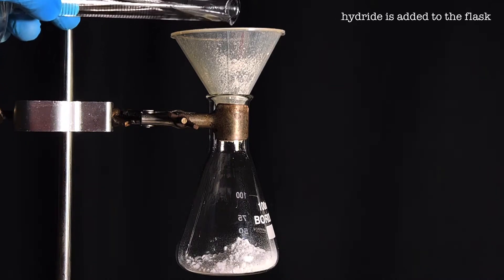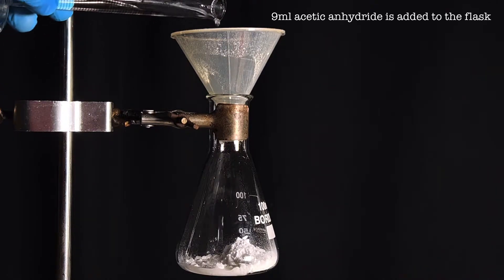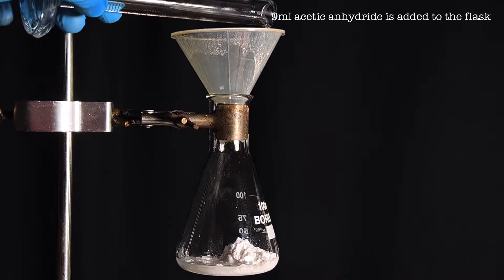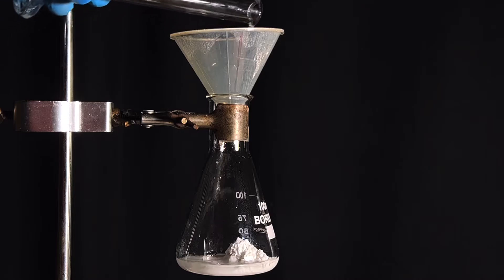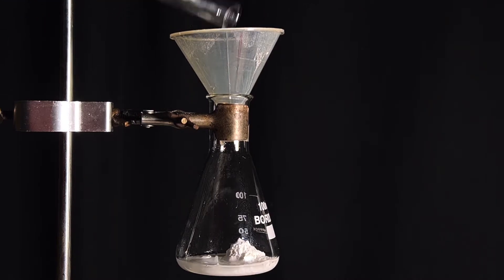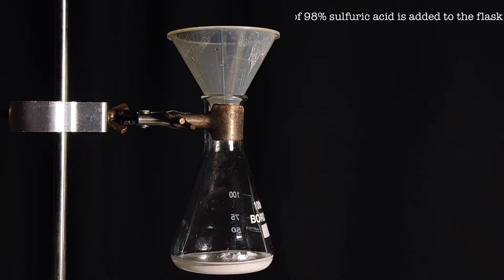Next, 9 milliliters of acetic anhydride was added to the flask. The acetic anhydride was added in such a way that it washed down all the salicylic acid residue that was present on the powder funnel. Next, 5 drops of 98% sulfuric acid was added to the reaction mixture.